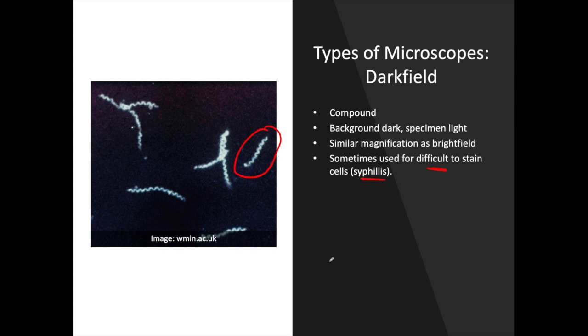If you go to the dentist, many dentists nowadays like to show people all of the bacteria on their teeth to try and drive home the concept of plaque and bacteria on teeth. So they'll take a tooth scraping, kind of scrape the teeth a little bit, smear it onto a slide, and then show it to you using dark field microscopy so that you can see the bacteria. And the beauty of that is whether the bacteria are living or dead is not the point. The point is that you can actually see the microorganisms, and they didn't have to go through any kind of staining process. They could just put it directly onto a dark field microscope and look right at it right then and there.